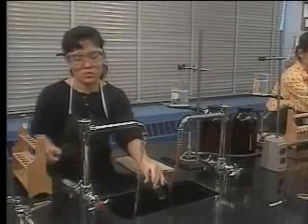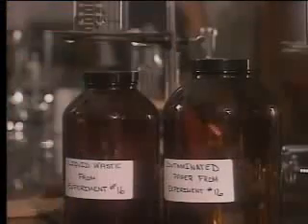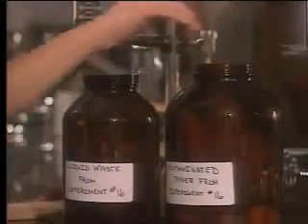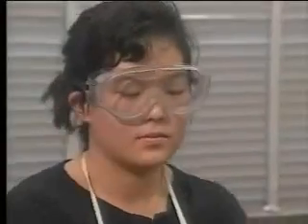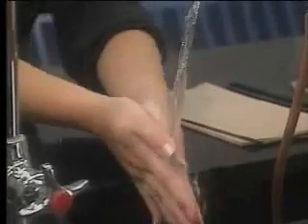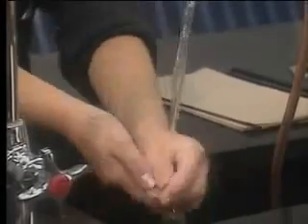Glassware should be thoroughly scrubbed and rinsed so it's as clean as possible for the next experiment. Liquid puddles or powders left behind on a lab bench can get on the next person's clothing or skin. Wipe them up thoroughly and throw the paper towels away in the proper container. And clean chemicals off your hands before leaving. There may be invisible chemical residues that could damage your skin or contaminate your food the next time you eat.